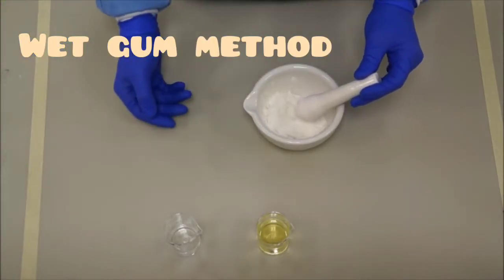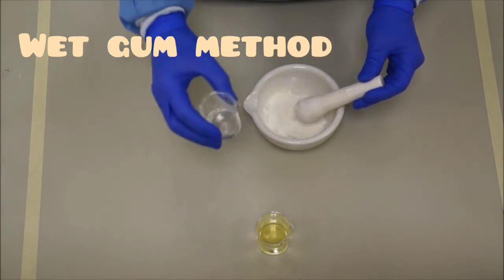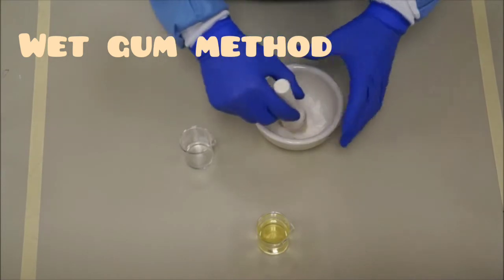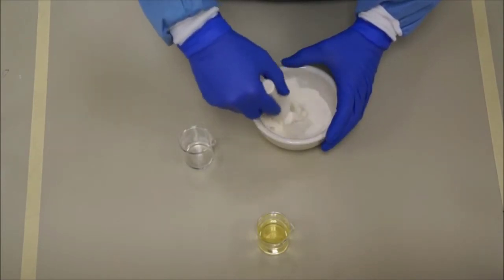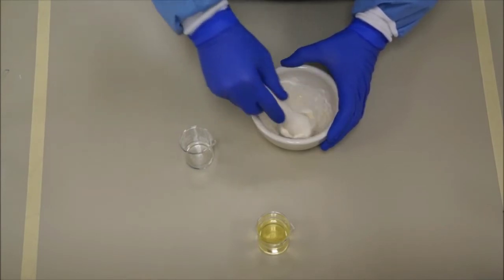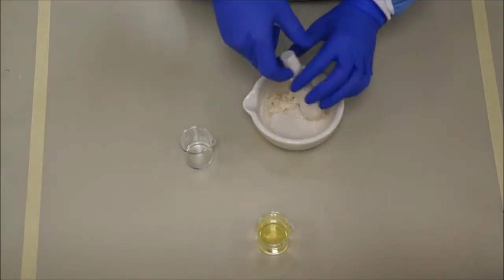Next is the wet gum method. You have to triturate acacia with water first, because it is the wet gum method. Keep triturating until a nice smooth, cream-type mixture is obtained.